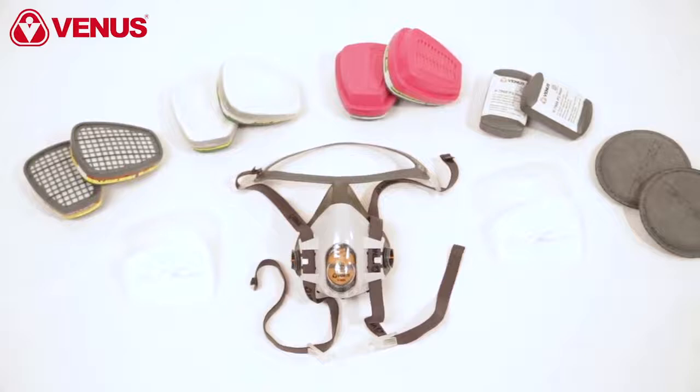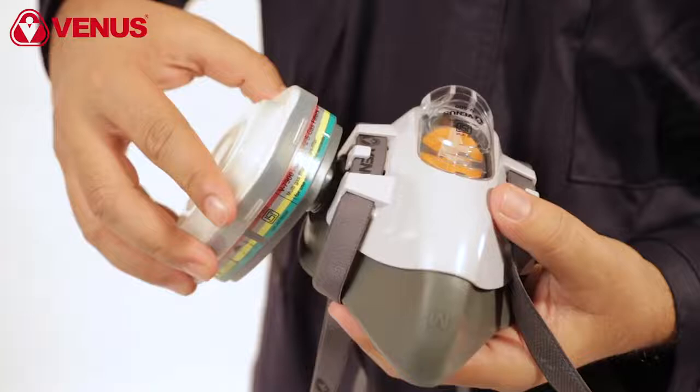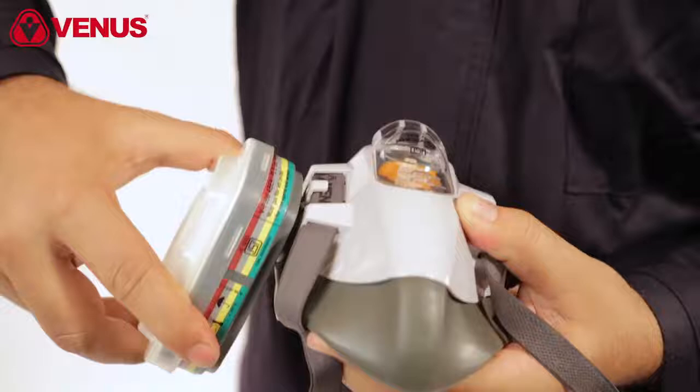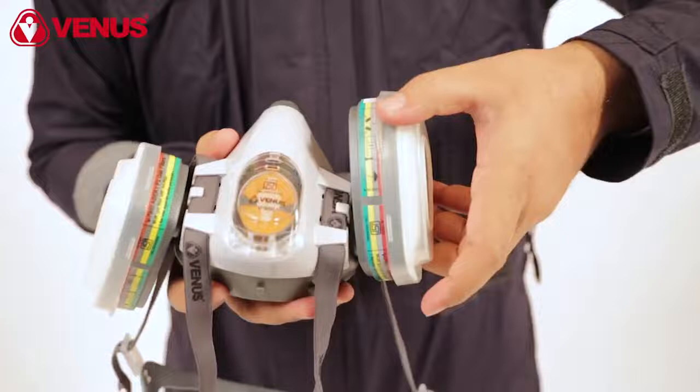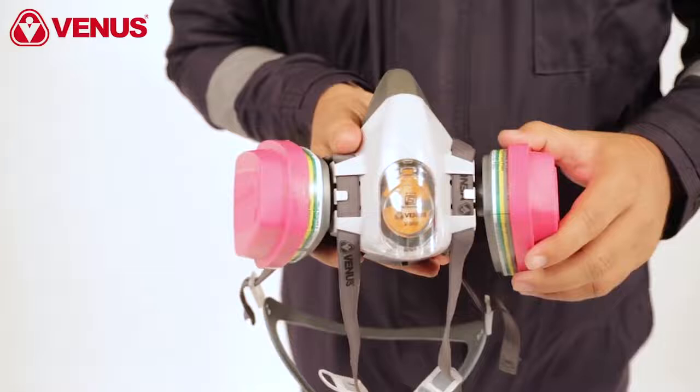Prior to fitting the respirator to your face, you should fit the appropriate V7900 series filter. The V900 series respirator comes with Venus's patented twist and click mechanism. Take the filter and place it on the face piece, and a single clockwise twist will securely lock the filter in its place.